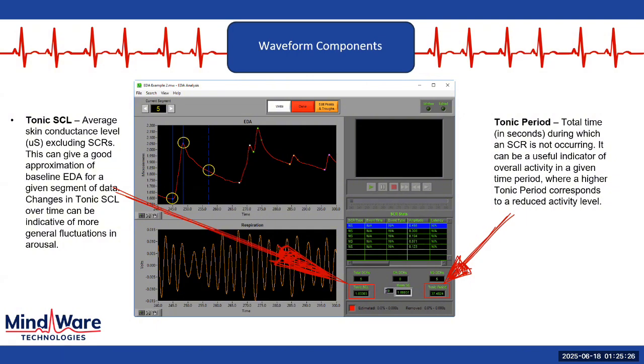The tonic period and SCL aren't reported as commonly as the mean skin conductance response and just how many SCRs occurred within there. This is in large part due to the fact that in some cases our data are not very clean. They could be from poor electrode contact, or if we had a lot of movement in our study, especially for collecting data from the kiddos. In a lot of cases, these specific points are not easy to identify, and thus, if we aren't looking to even report on skin conductance responses because we can't see these points very clearly, the backup and most common metric of this is the mean skin conductance level.